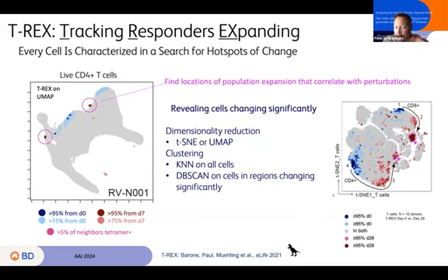So you'll annotate the data with your different conditions. It doesn't even matter particularly what they are. In FlowJo, we'll just call them 1 and 2 or something like that. And it will make the UMAP or t-SNE plot, your choice. It will look on that plot to identify the places where there is a difference between your two conditions, and use that as a locus point for starting the clustering. So it'll use a DBSCAN clustering algorithm on the places where there was a real difference between the two cases. And you can set some thresholds here.